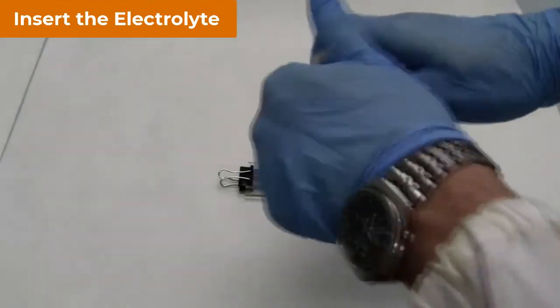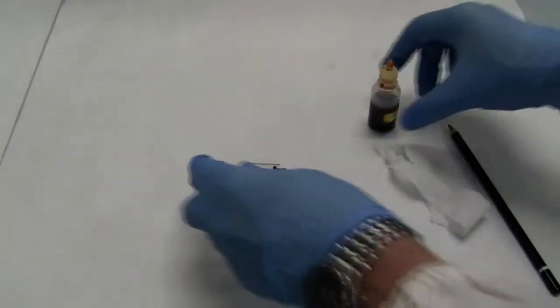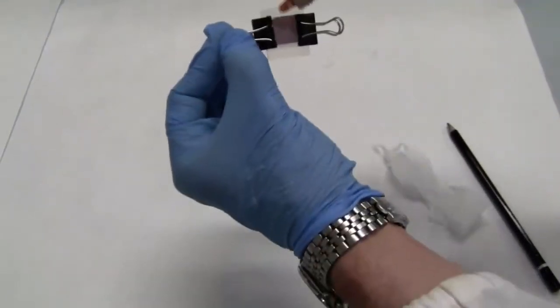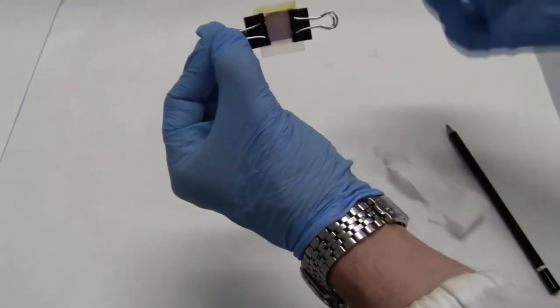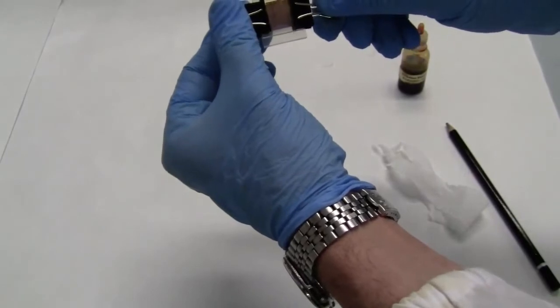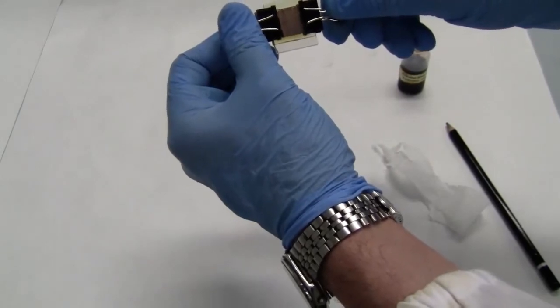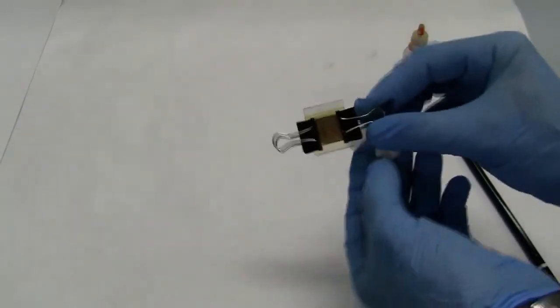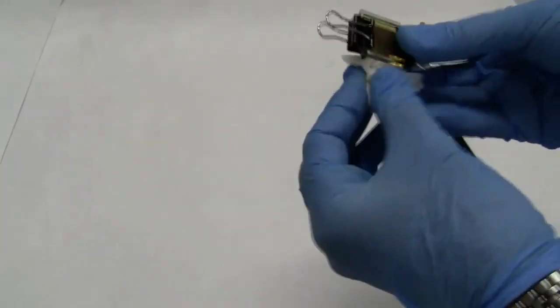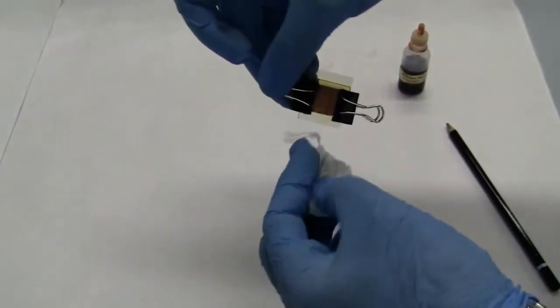Once the cell is complete, we still need to put in the electrolyte, which is a liquid, normally acetonitrile or a high boiling solvent, like in this case ethylene glycol, in which iodide salt, normally potassium iodide, and iodine are inserted. Keeping the cell in this condition, we can remove our clips for a while to help the liquid enter better.